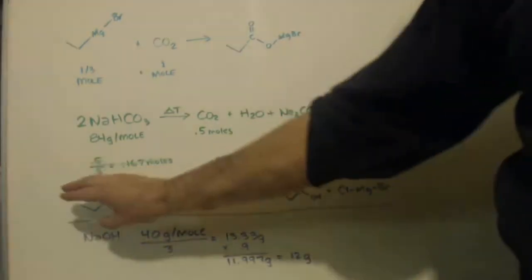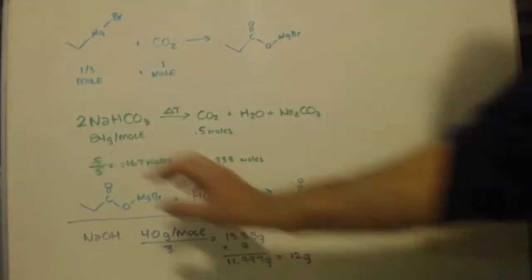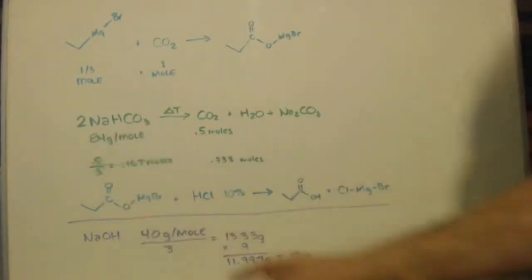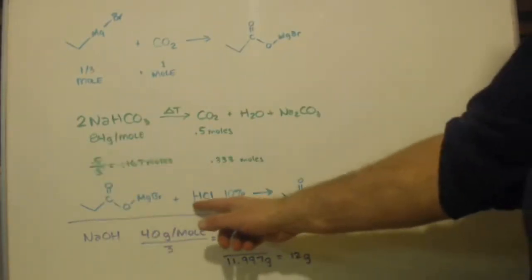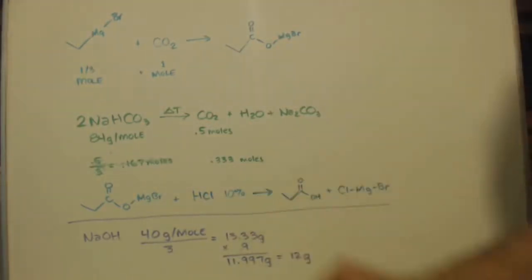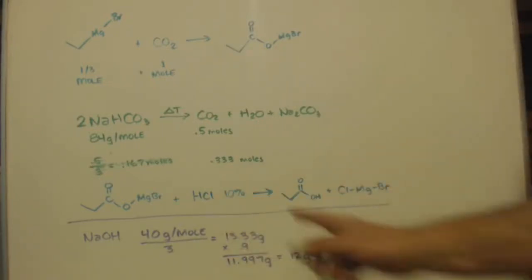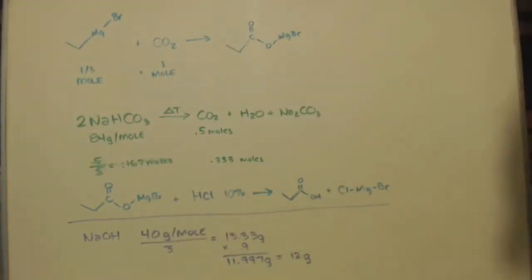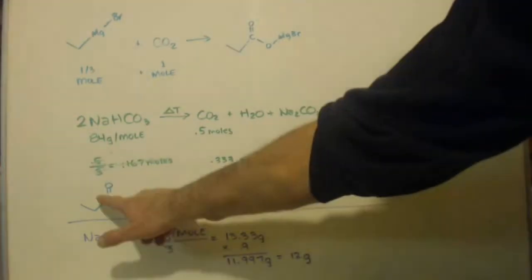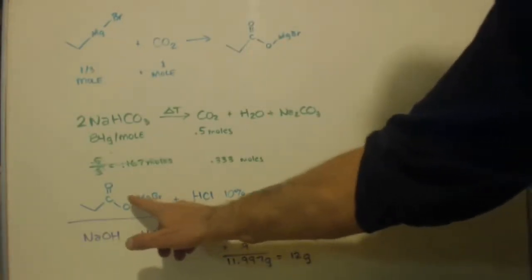But it doesn't matter, because we're talking about trying to be equal, you know what I mean? So actually on this one, I put in a full mole of, I think I went over this pretty good in the video when I did it, so I'm not going to go over it that much. But I put a full mole in, a third to quench it, meaning change this salt into the acid, just like if this was sodium propanoate. Now, it's not, it's magnesium bromide.